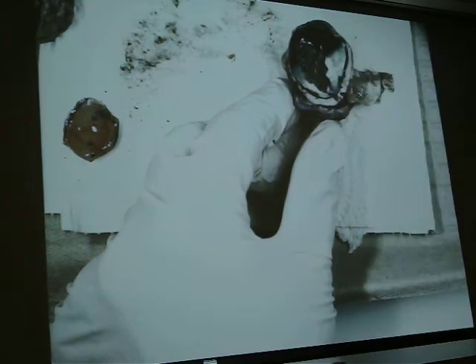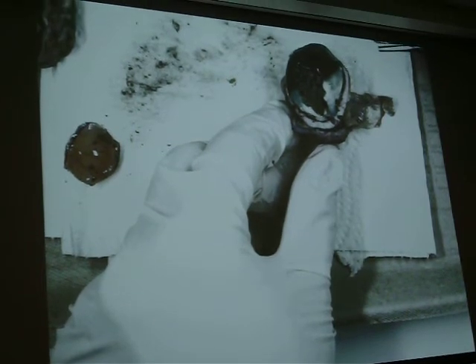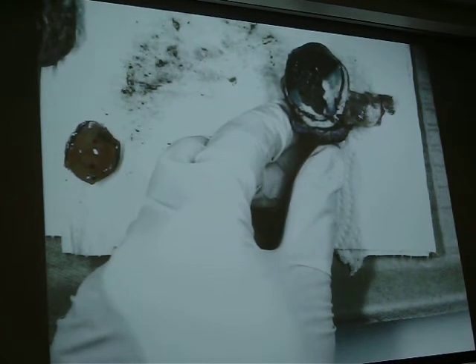This is the stuff I'm pushing around to the retina. Just imagine — that can become detached in the normal animal, catching the retina. If it's bad and doesn't reattach itself pretty quick, it's going to result in blindness. I don't think I ever saw it clinically, but I sure heard about it.